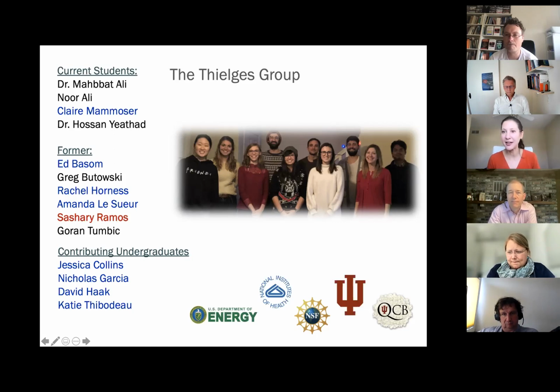You do the best you can, and you report if they are perturbed. All of these were folded. They bind their recognition partners reasonably well. So yeah, there could be perturbation, and you report that. We've had ones where they don't fold or something, and we just have to toss the data or not look at those residues. Okay.